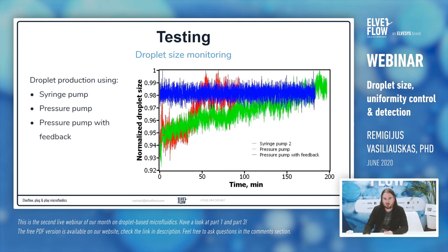Comparing with the pressure pump without any feedback loop, the droplet size variation is quite minimal in the green line. But it still changes over time — if you're collecting droplets for two, three, or five hours, you will see the droplet size drifting. With the pressure pump plus feedback shown in the blue line, it's very stable going for several hours with no changes, allowing you to produce droplets for a very long time.